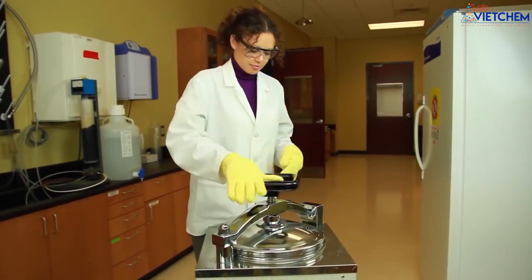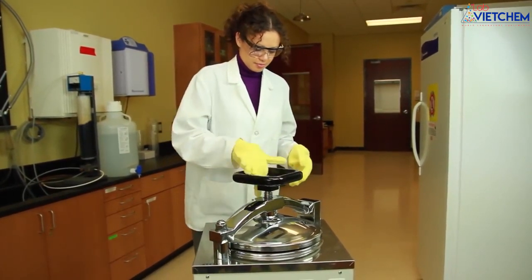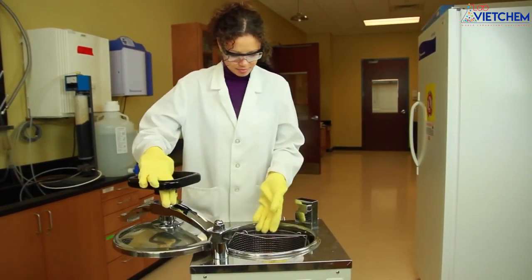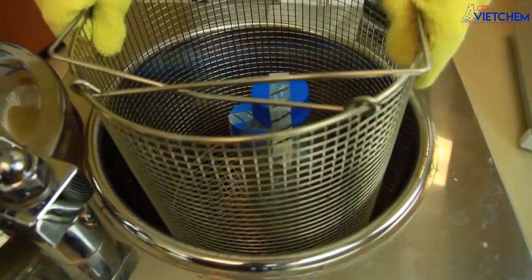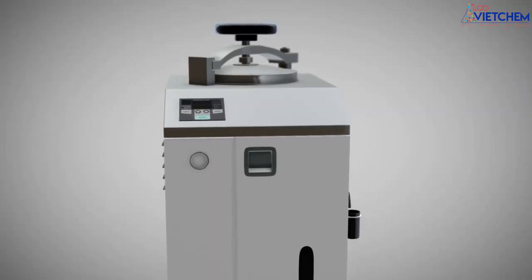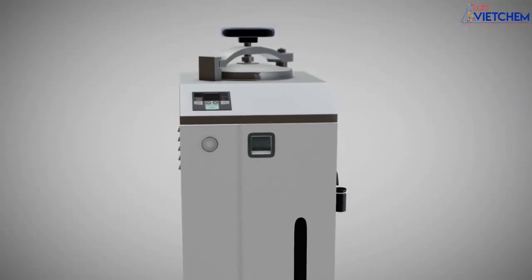Once the cycle ends and the pressure gauge reads 0 psi, slowly open the door and remove the basket. The black lines are visible on the tape, indicating that the proper temperature was reached. The autoclave is now ready for another run.